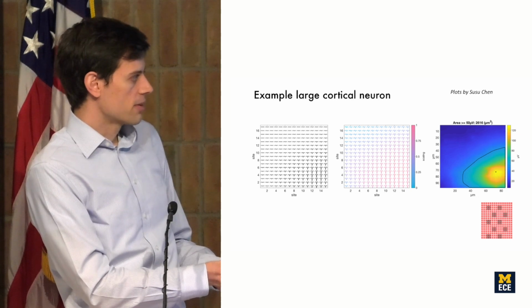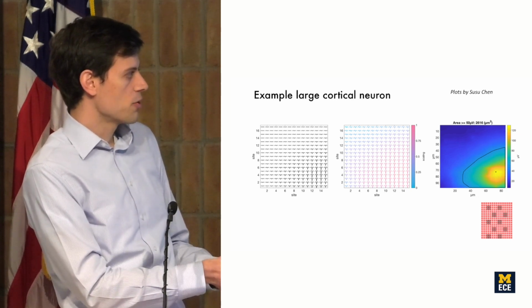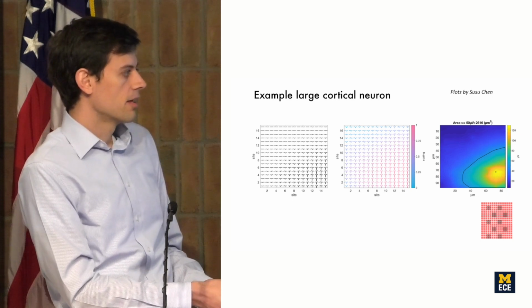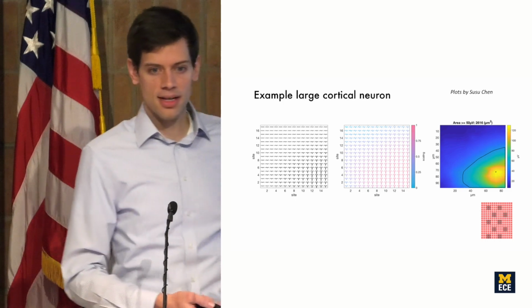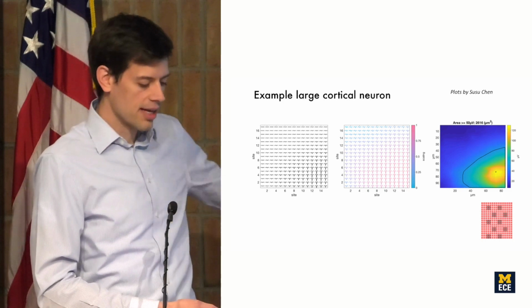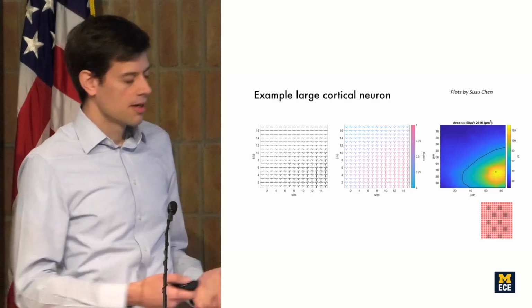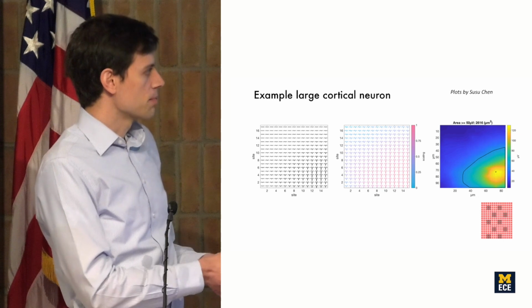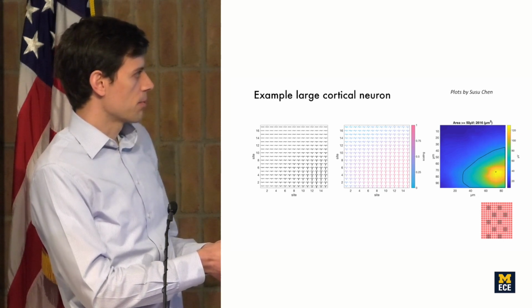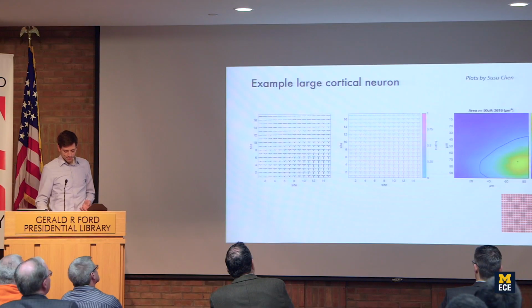And you can tell, so this color map overlays this red square, and you can tell that if you overlay this here, as we expect from the kind of neurons that I showed, neurons like the example one that I showed you, you would see this neuron on multiple NeuroPixel sites, and for a neuron like this, the NeuroPixel's density is clearly high enough. In this middle one, I'm just amplifying some of the lower amplitude sites so that you can see their shapes better.